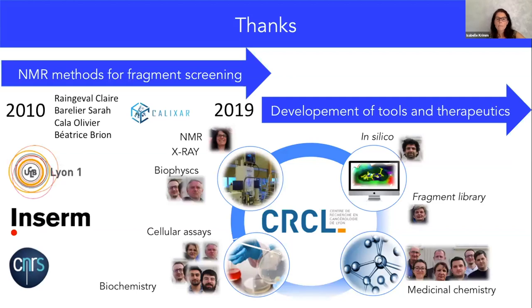Now I am developing compounds as tools and therapeutics in the new lab, as it was said in the introduction, at the Center of Cancer Research in Lyon. And so I use NMR, but really to design and make hit-to-lead optimization in order to go to therapeutics.